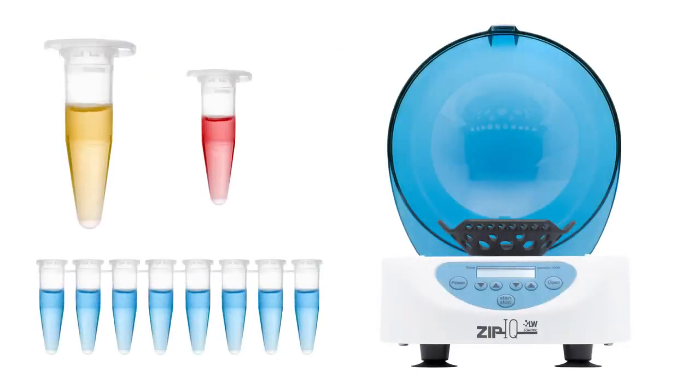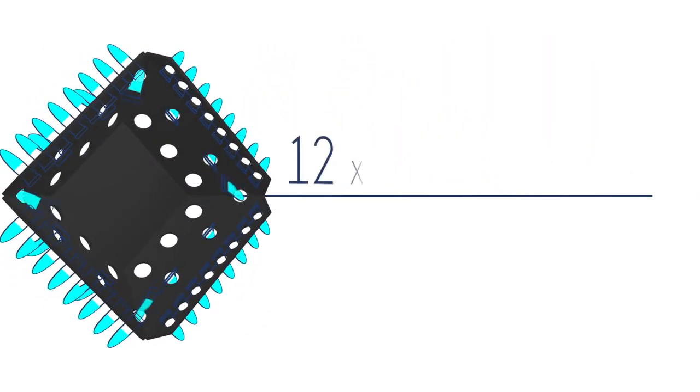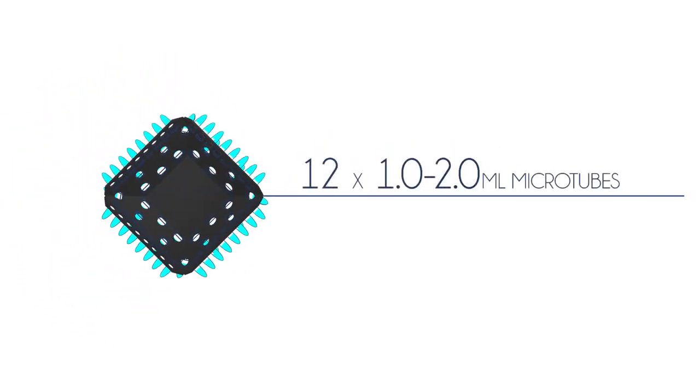The ZipIQ can do both: spin 4 PCR strips, 12 0.5–0.9 milliliter microtubes, and 12 1–2 milliliter microtubes.